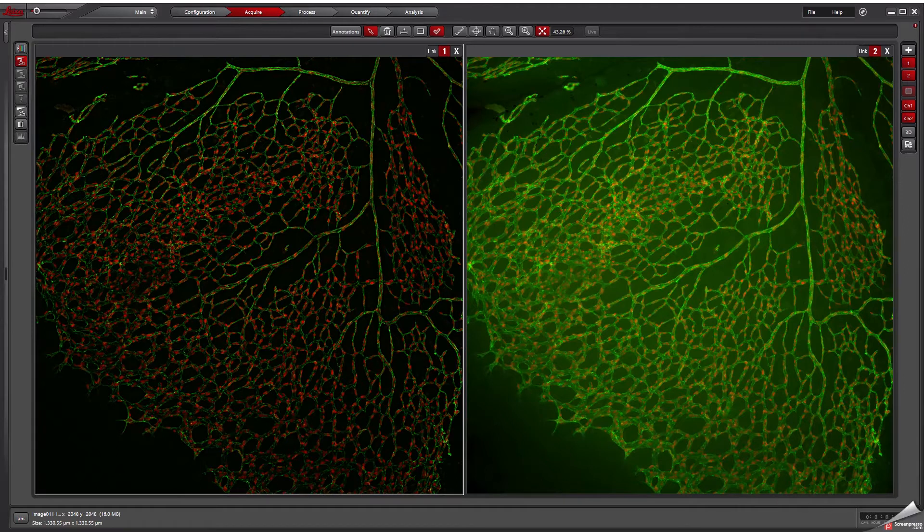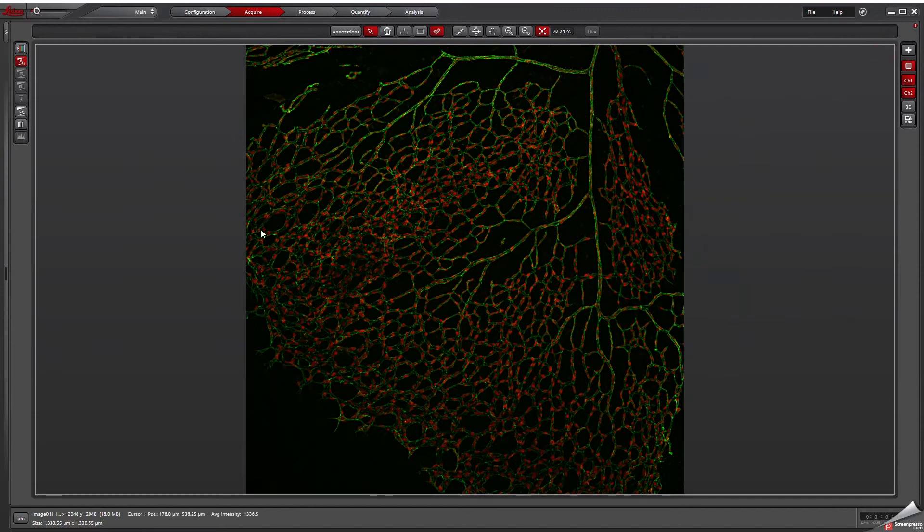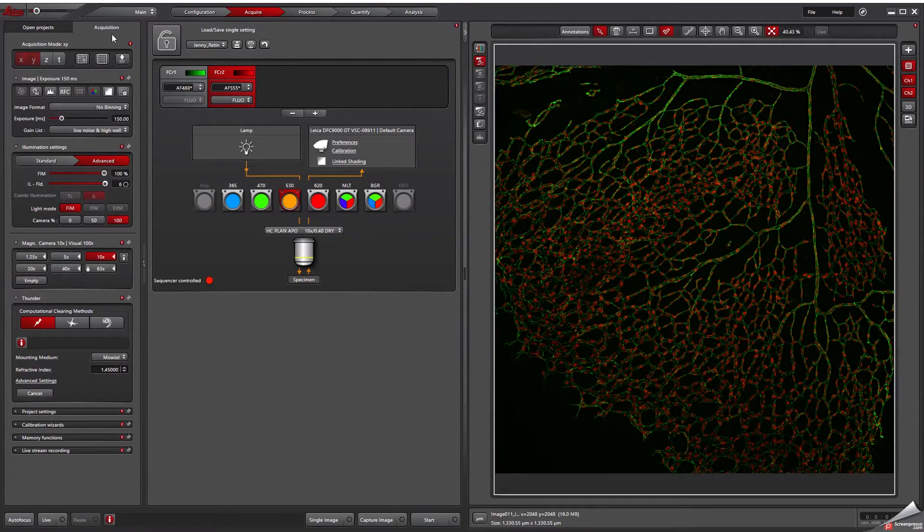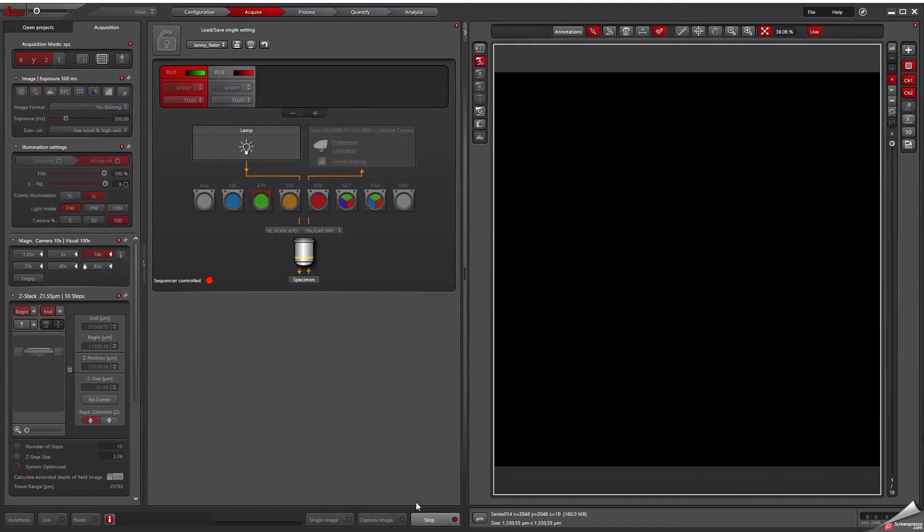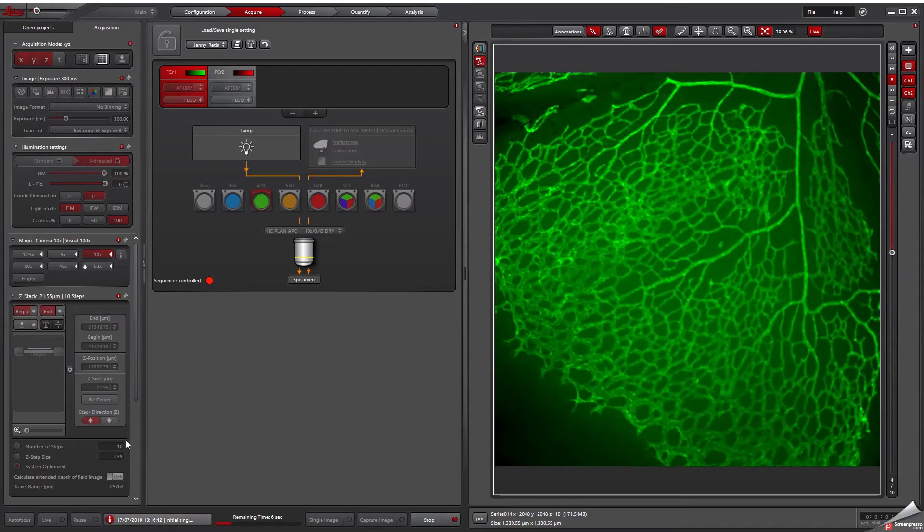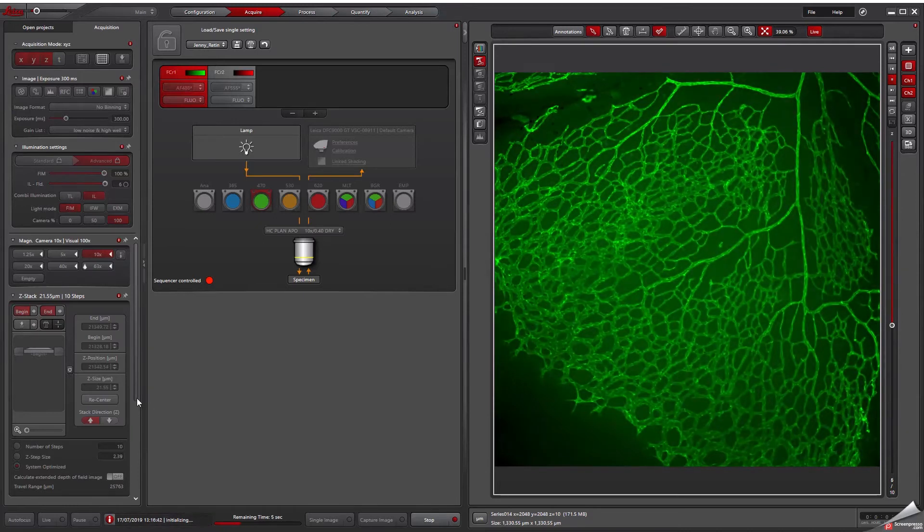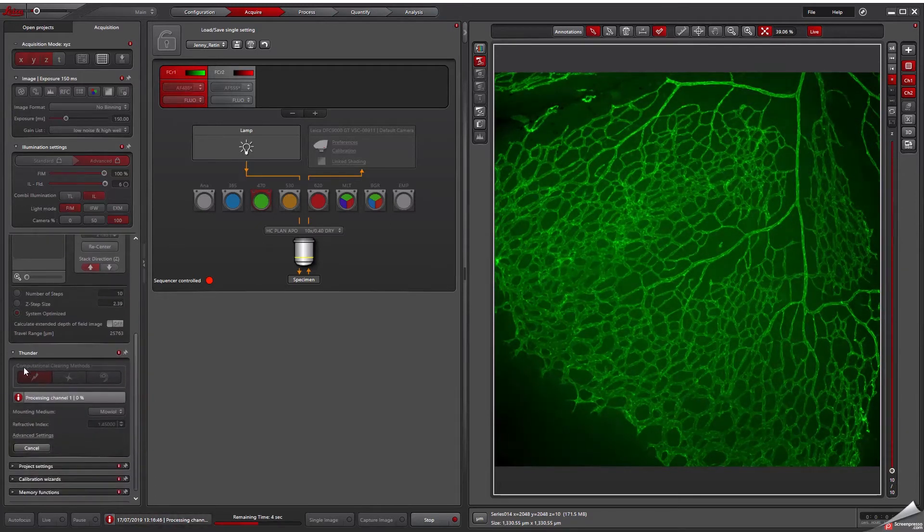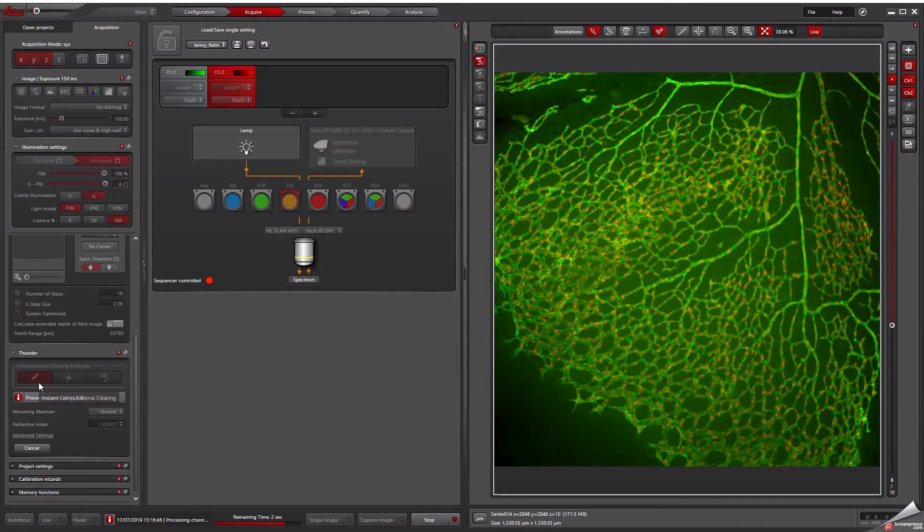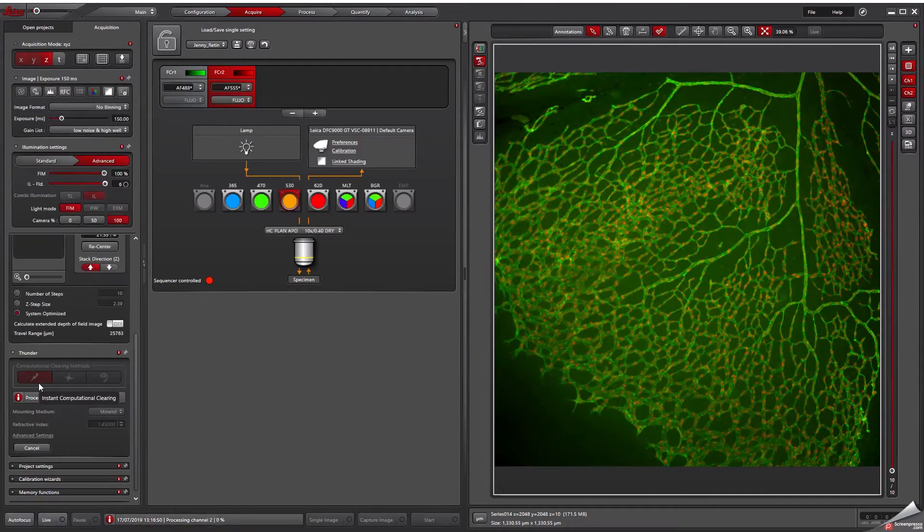But for quantification, you want to observe the whole Z-stack, so the volume of the retina section. So let's acquire a Z-stack. We go back to Acquisition, select Z and press Start. You can choose different Thunder modes depending on the volume of your sample. I'll stick to Instant Computational Clearing for now.